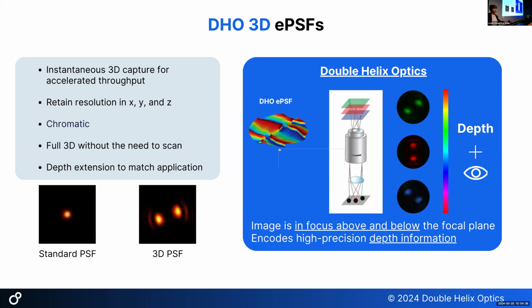Yeah, I guess the part that seems like a really interesting and difficult challenge to me is that even if you know the PSF, you can validate that, there's still validation left to do to account for assumptions made by the network you train for 3D reconstruction. So the PSF in that imaging comes first, but then it seems like there are additional steps required to get to the 3D structure of the object or image. And so I might be missing something, or it's just an interesting problem. Yeah. I'm not sure I can answer it further than that. Yeah. I appreciate that.